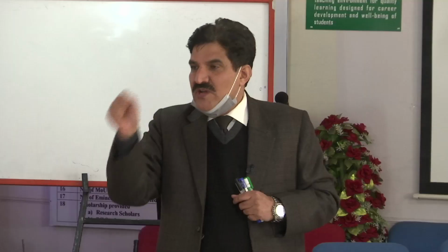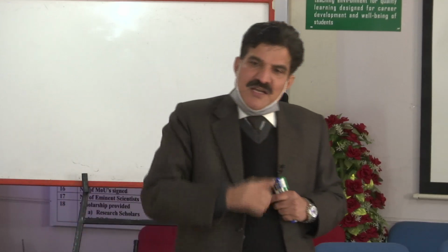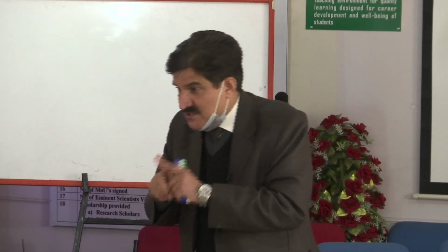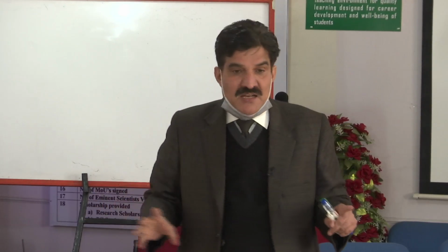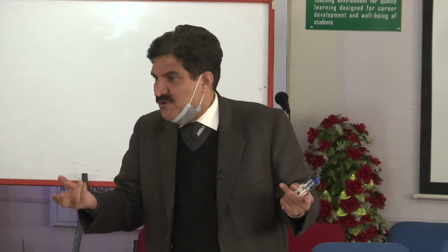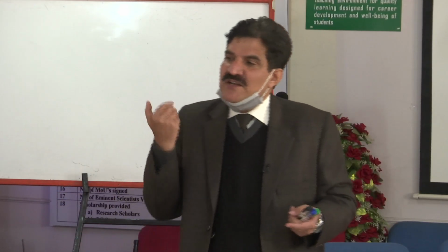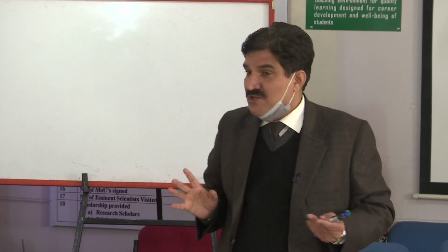So for that purpose, the first point is that for plants, for bacteria, or for any other system, we require a buffer system along with the detergent, so that you get disruption of cells and of the nucleus membrane-bound organelles, and you finally get DNA out. DNA will be in solution form. Now what is your choice?